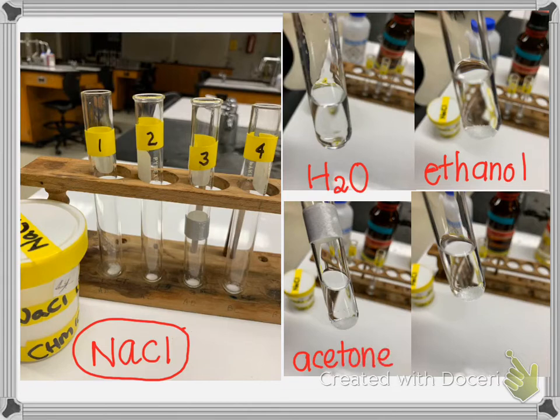And this is NaCl in petroleum ether. Now it really is hard to see, and I tried to do the best I could with pictures. But if you look, NaCl in water, which we should know from our life experience, this one is soluble. And I'm going to work the first one with you, and then I'm going to have you do the other ones together.